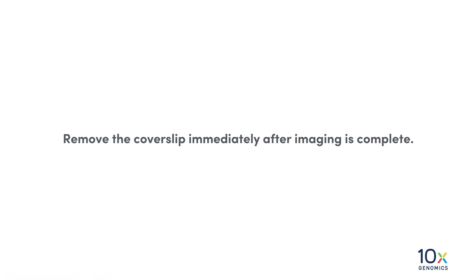We have imaged the tissue. Now we will remove the cover slip. Remove the cover slip immediately after imaging is complete.